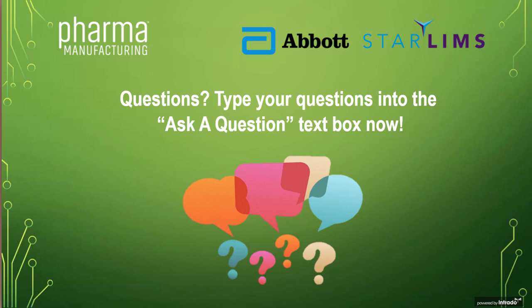Okay, perfect. Maybe another follow-up for you, Sam. Which databases does your solution support? Sure. So STARLIMS supports both the SQL Server and Oracle databases when you are installing it on your own infrastructure. In our cloud environment, since it's a fully managed service that our administrators are administering, we only offer SQL Server.